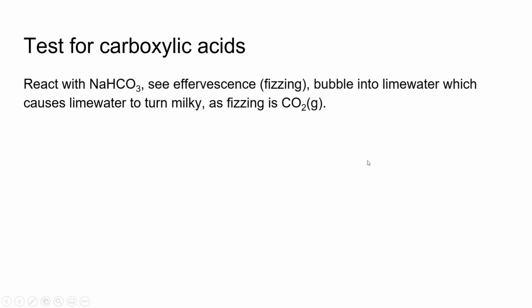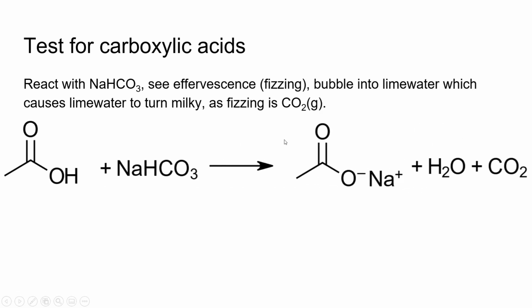Next will be carboxylic acids, one that you've definitely seen before. That's to add sodium bicarbonate, and we'll see effervescence or fizzing, and then we can bubble that fizzing into lime water, which will turn the lime water milky, as the fizzing is carbon dioxide gas. So here is the full balanced equation. You should be able to see where everything comes from. So we get the salt, as this is an acid-base reaction.